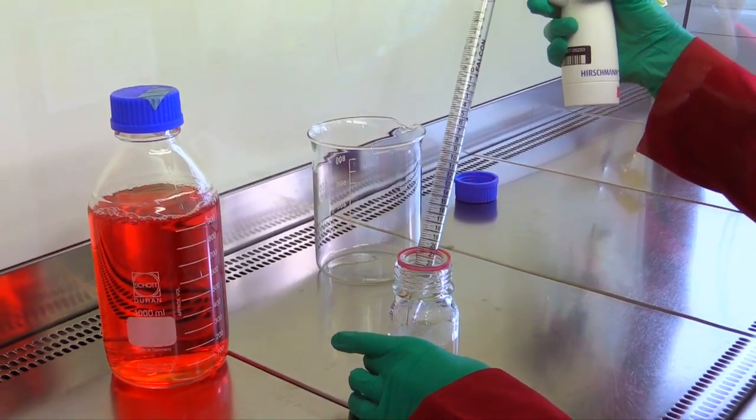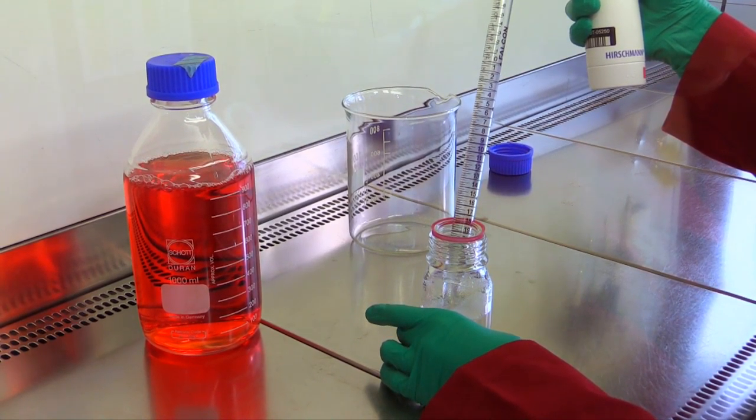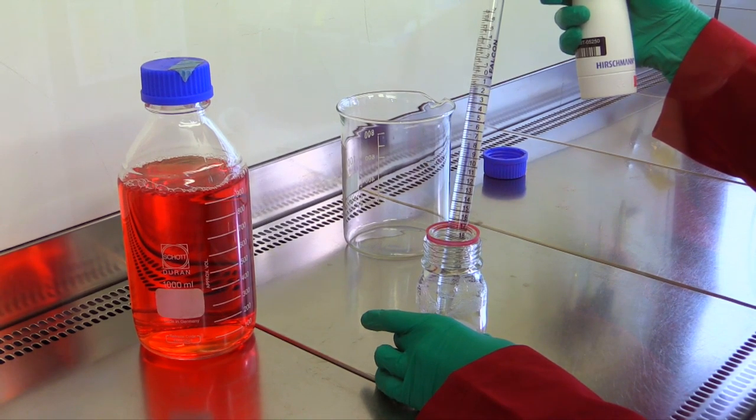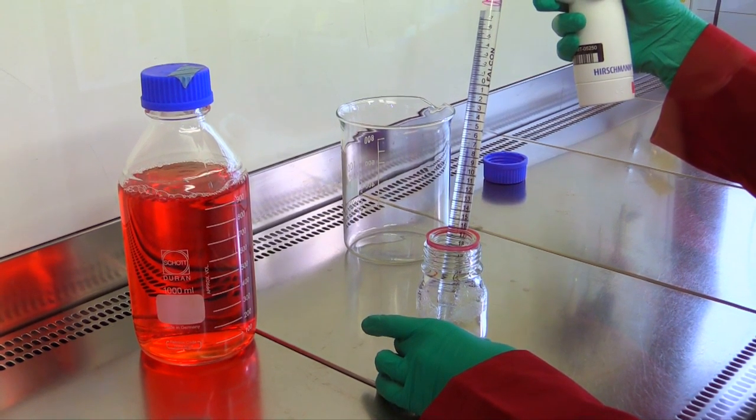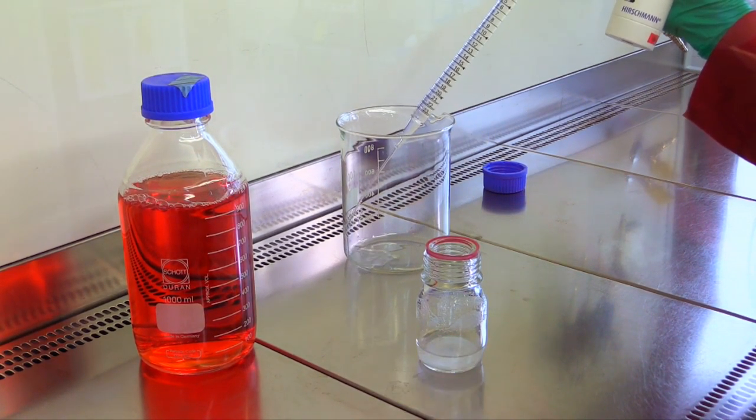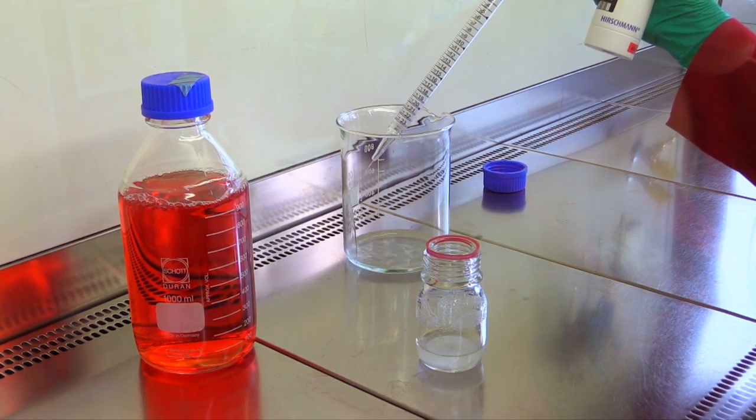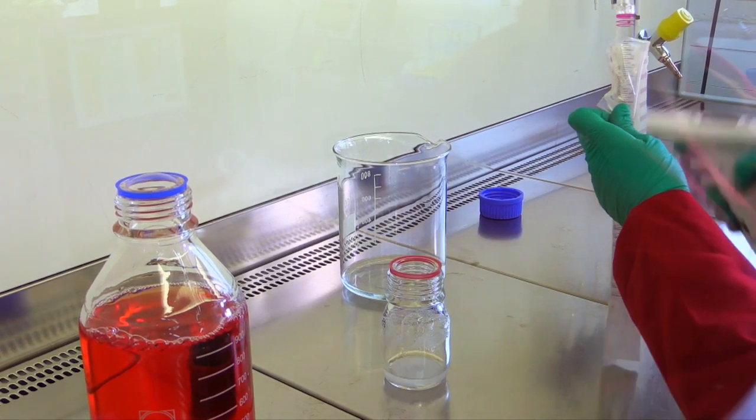Before transferring the sterilized microcarriers into the spinner flasks, they have to be washed one to two times with the culture medium that was specially designed by Lonza. Therefore, the microcarriers are allowed to settle, the supernatant is carefully removed with the pipette, and the carriers are rinsed in the culture medium.